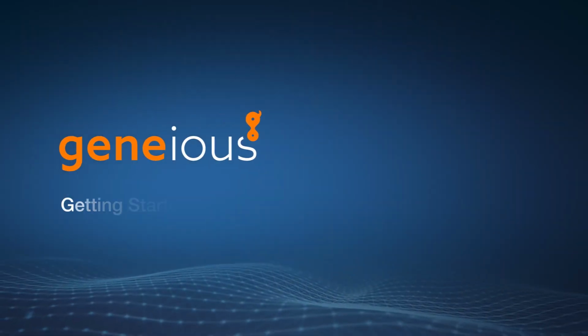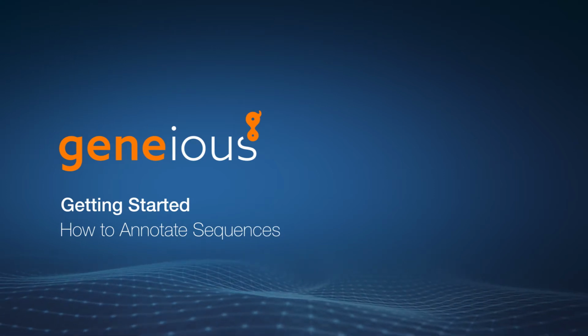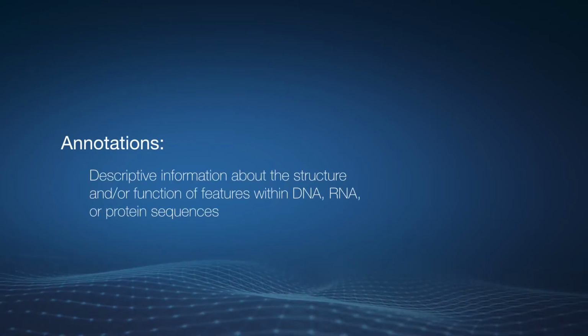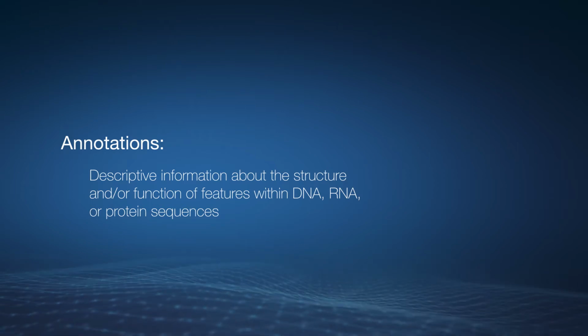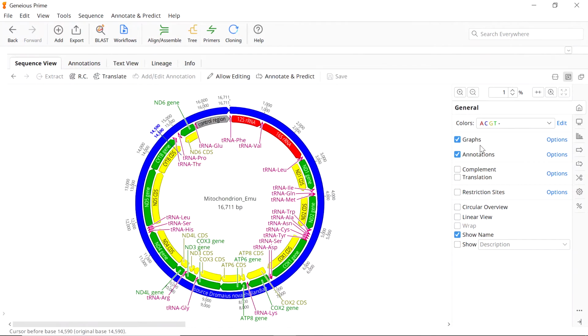In this Getting Started tutorial, I'm going to show you how to add annotations to sequences in Geneious Prime. Annotations provide descriptive information about the structure and/or function of features within DNA, RNA, or protein sequences. For this example, I'm viewing a mitochondrion genome file.